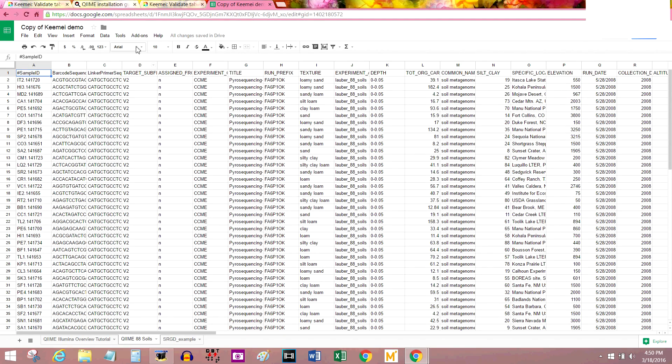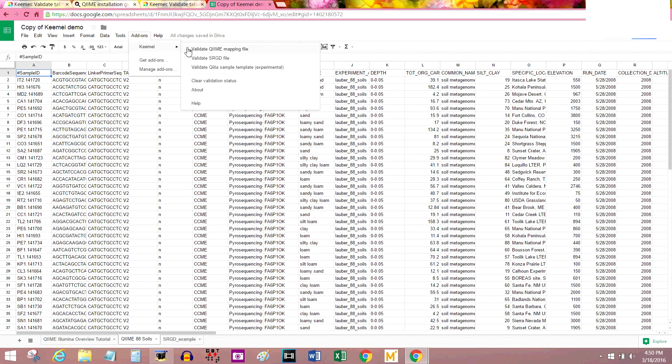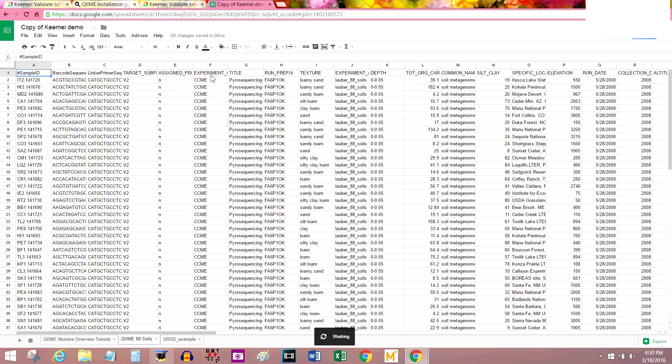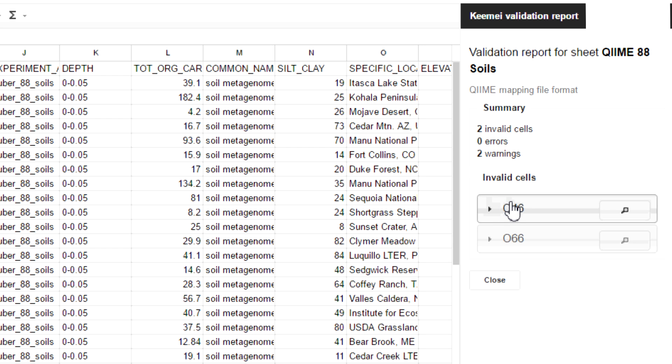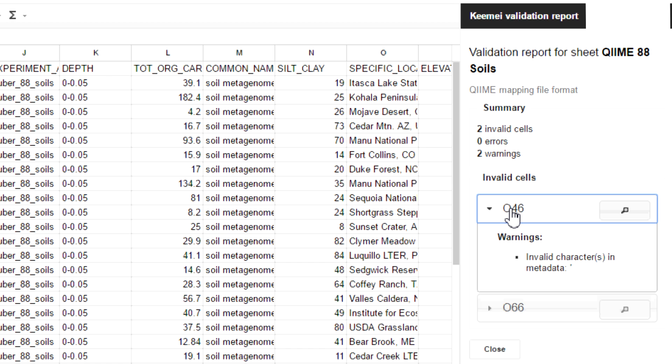This is the kind of set that Keemei was built for. I'm going to go to add-ons, Keemei, validate QIIME mapping file. So, nothing appeared to change color, but we did get a report here on the right. And it says two of the cells are invalid. O46 and O66.